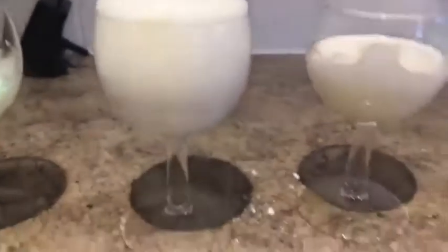So is the non-bio powder. But yeah, the toilet cleaner has had basically no reaction. This is just making a mess, and so is this one. This one, nothing's really happening. The washing up liquid, we've got some chromatography going on, but there's nothing really happening. But the majority of them actually, see, that one's having quite a big reaction to it. But yeah, so this is the baking soda.